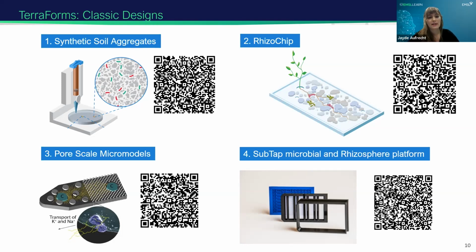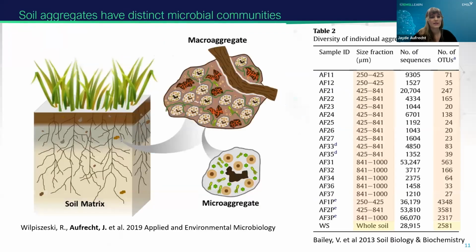So we're going to be presenting on synthetic soil aggregates, the RhizoChip, pore-scale micromodels, and the SubTap microbial and rhizosphere platform. So I'll kick us off by starting to talk about the synthetic soil aggregates.